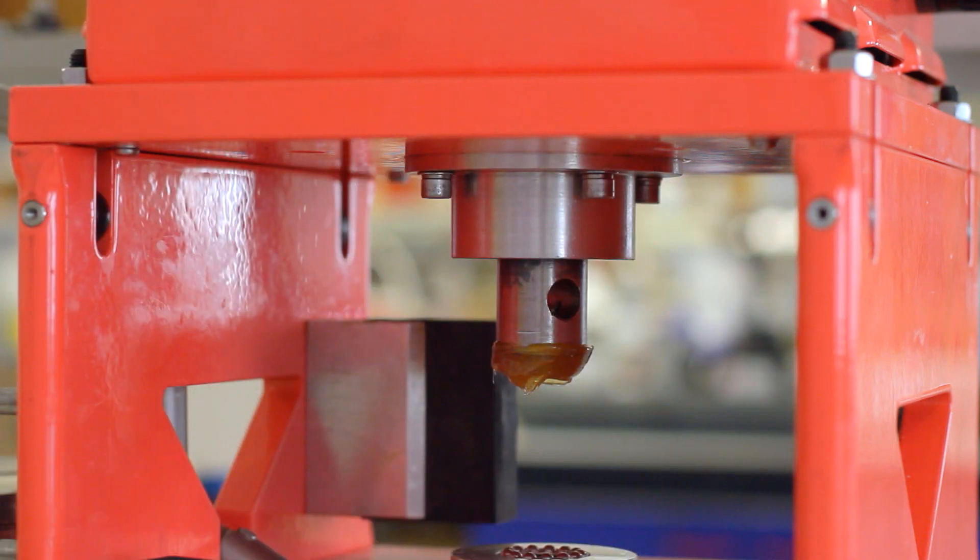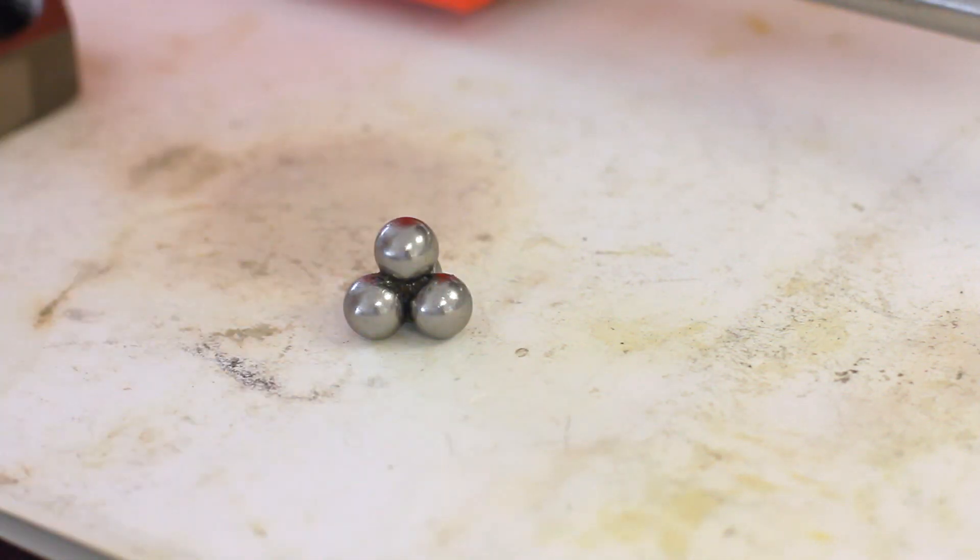The lubricant is not able to control the metal to metal contact between the balls. The friction and wear causes the temperature to increase and the balls melt and weld.